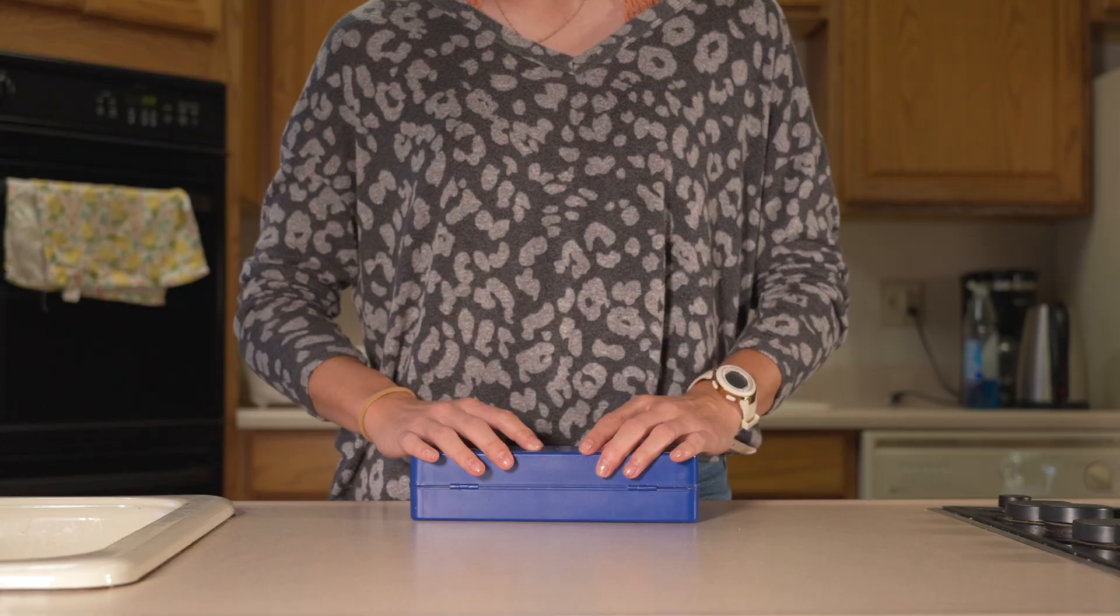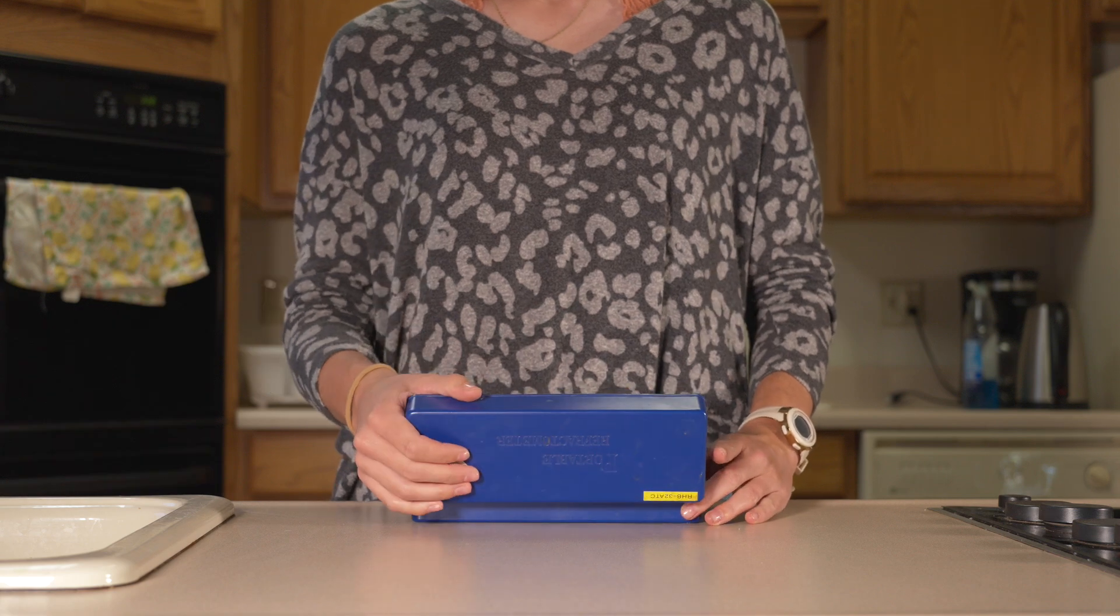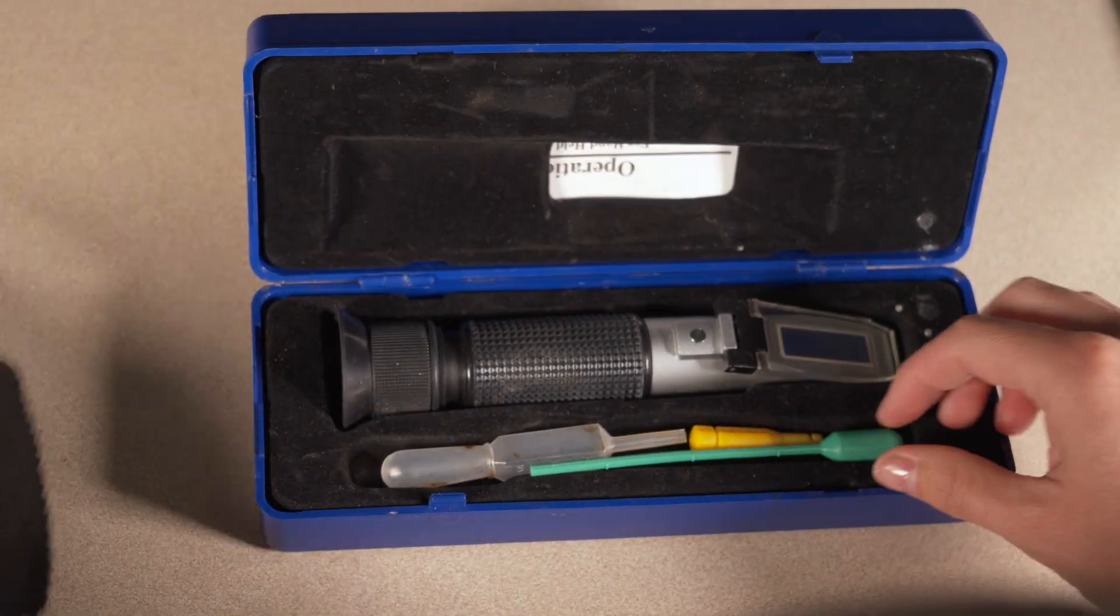Today I thought I'd share a little bit of info about refractometers. Refractometers can be used to measure the concentration of solutes in solution.